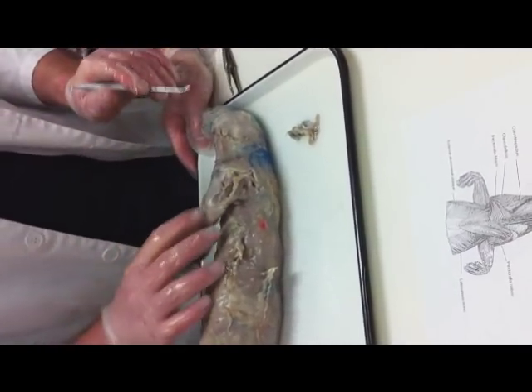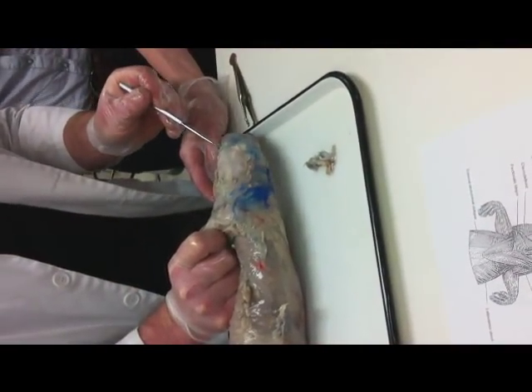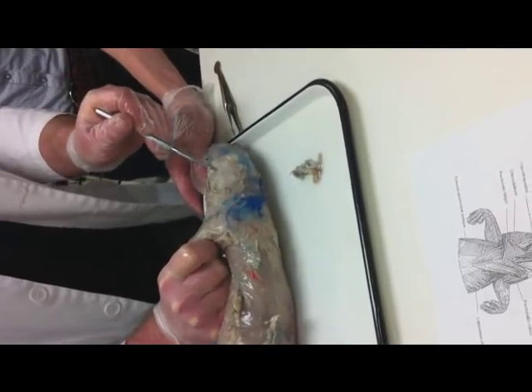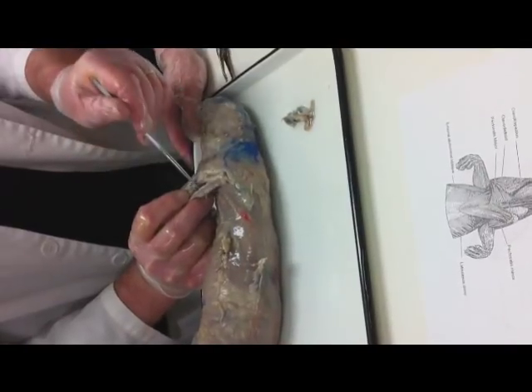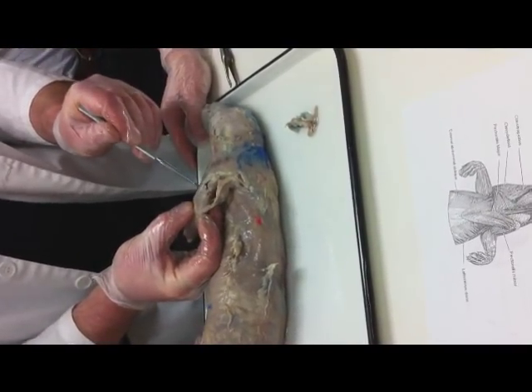Remember those ones, okay? So now, up around the mouth, I have the masseter right there. Up right on the forehead, I have the temporalis. So, masseter, temporalis, clavotrapezius, acromotrapezius, spinotrapezius, latissimus dorsi, dorsal epitrochlearis, triceps long head, triceps lateral head.